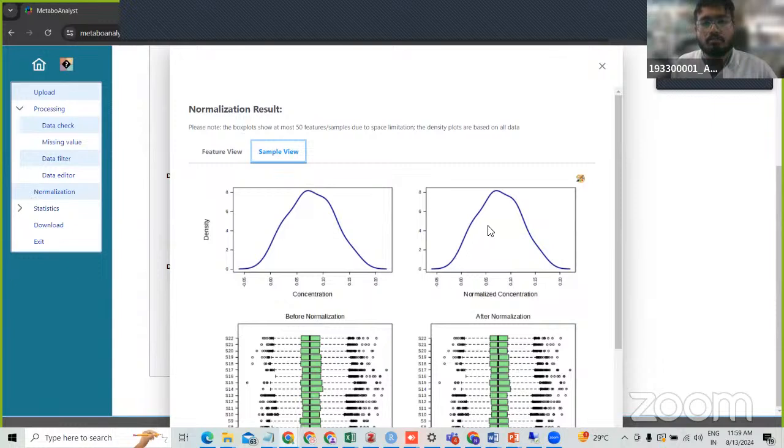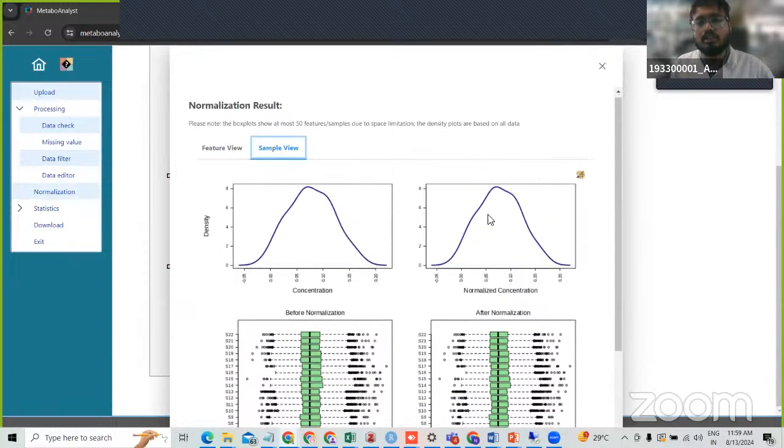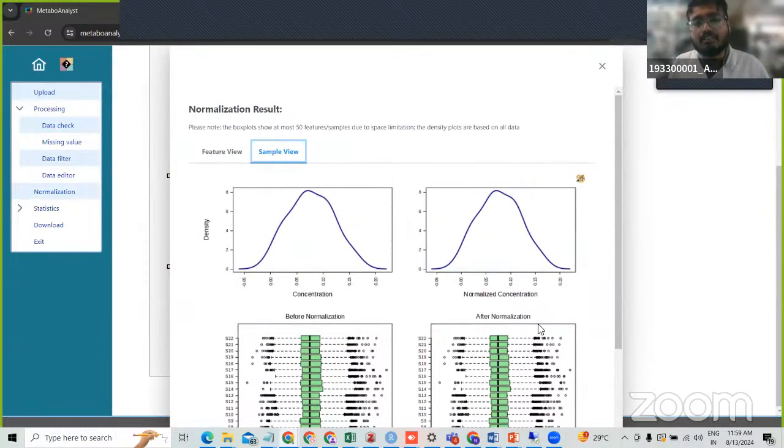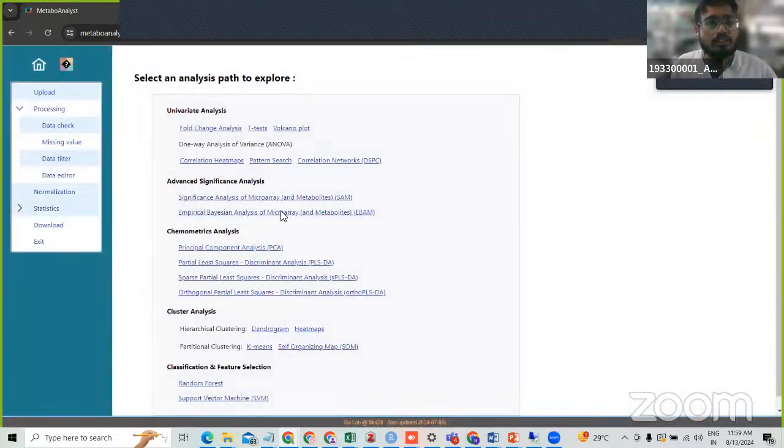So this is the kind of pattern. From the Gaussian distribution of what Avinash showed you from the peptides, finally when we identify the proteins and their intensity, this is the distribution that we aim for, where the medians align to each other. Once the data follows this particular pattern, then we can allow different statistical testing by proceeding.